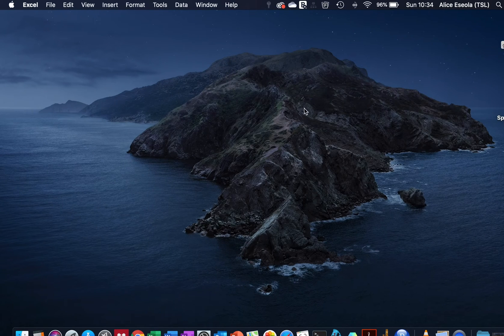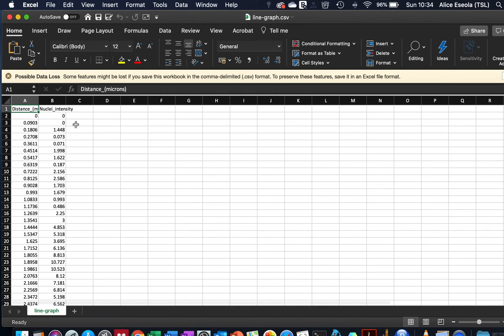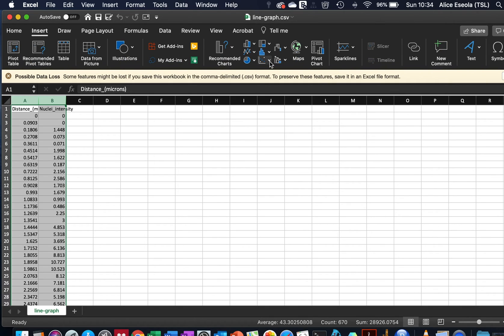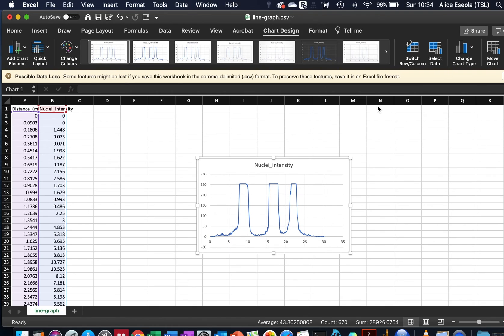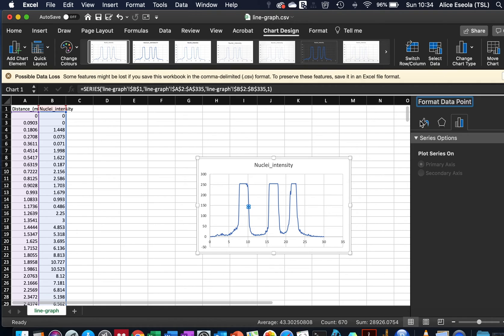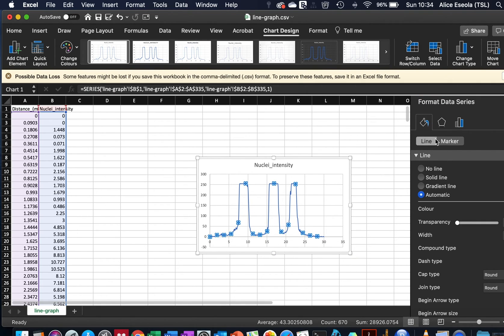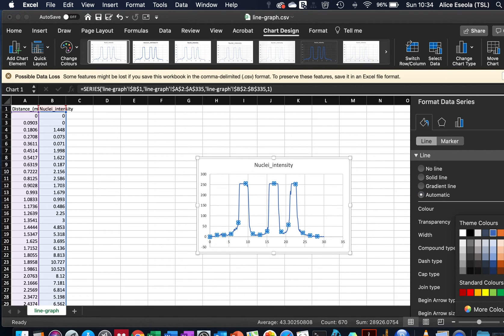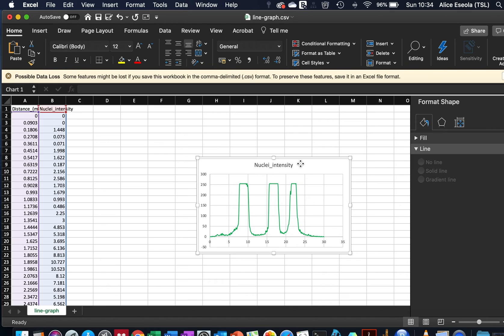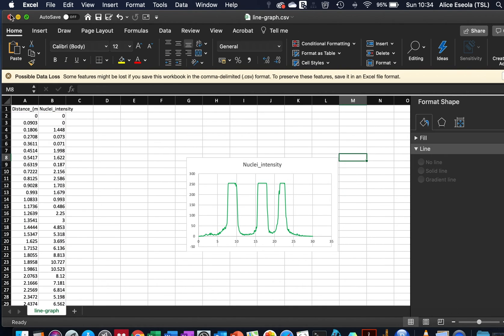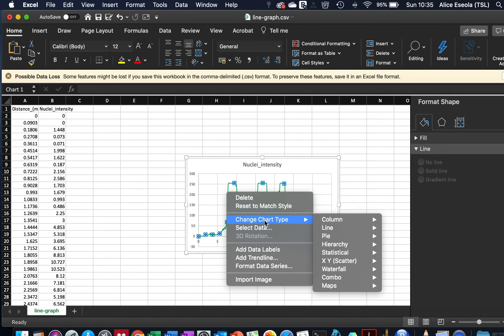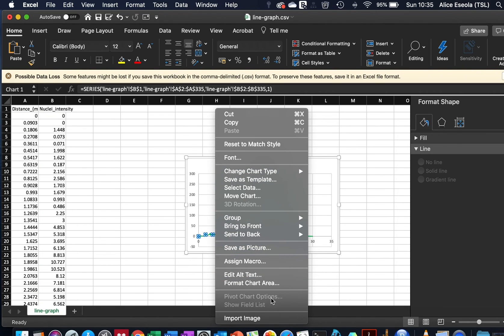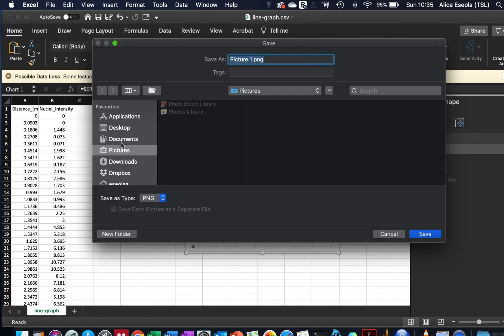This is the value of the line plot that we saved the data earlier. We can also come to the Excel file to plot our line graph. Here we have a line graph, we can change the color to green, and you can edit the font size to whatever you prefer to work with. Export this once you are done with the beautification of the graph. You can save this as picture and I will save it to the desktop.